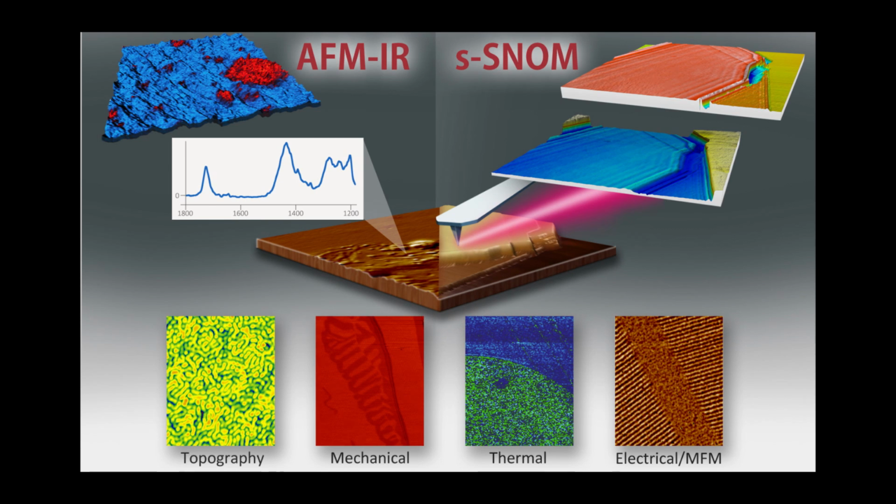There's a question about would it be possible to perform AFM-IR analysis in controlled atmospheric conditions. The system is enclosed, and we do that for the primary reason that we recommend that the system be filled with dry air or dry nitrogen.